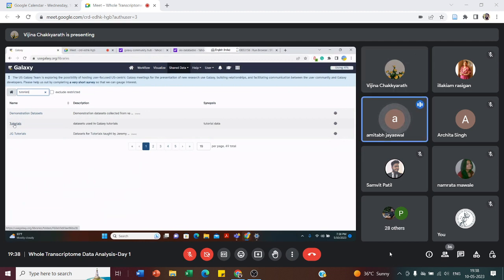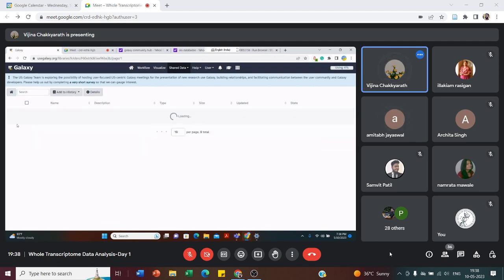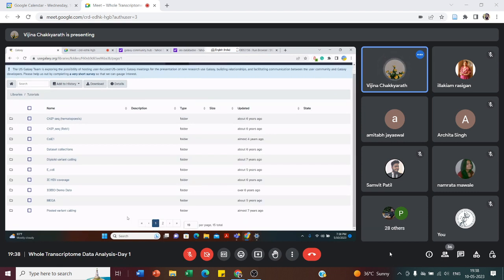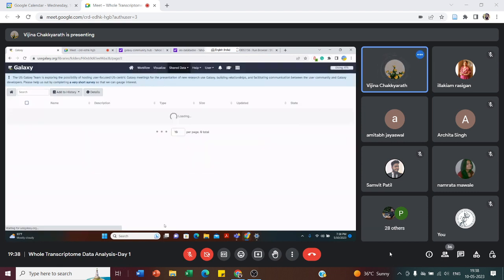Ma'am, within tutorials, what to do? I have come to this tutorials point. You just click tutorials here. Below, like below the second tutorials, you just click that. Then you just go to the second page.